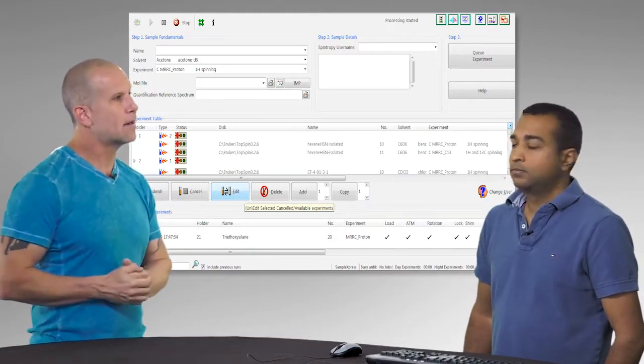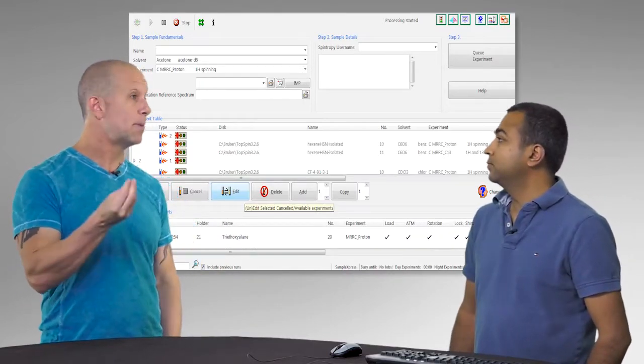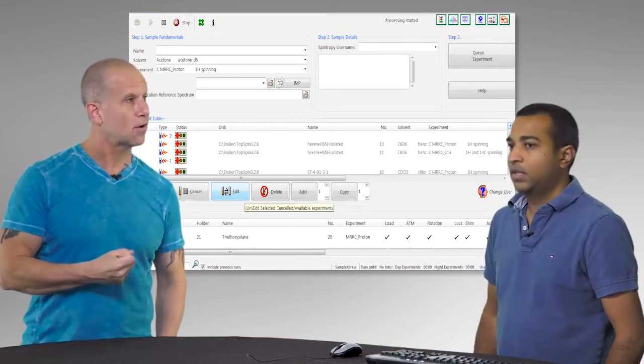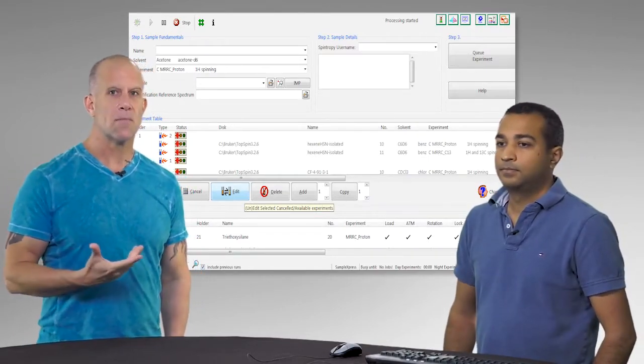And then you've created a package for getting the data so that it doesn't rely on you being at the spectrometer at all. It's a completely cloud-based service called Spintropy. So the second half will look a little bit at that. So let's start with IconNMR.